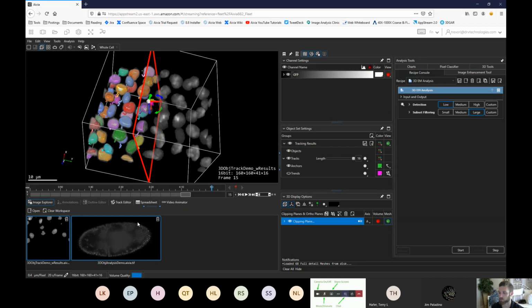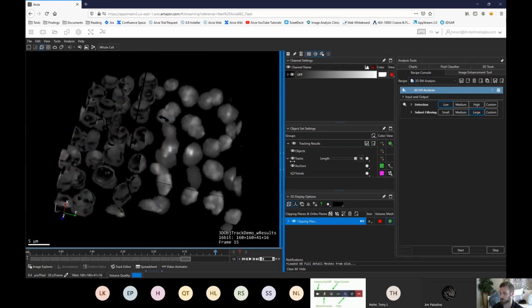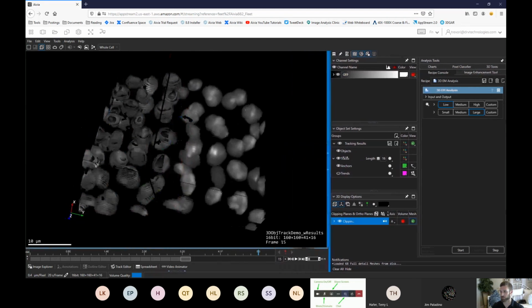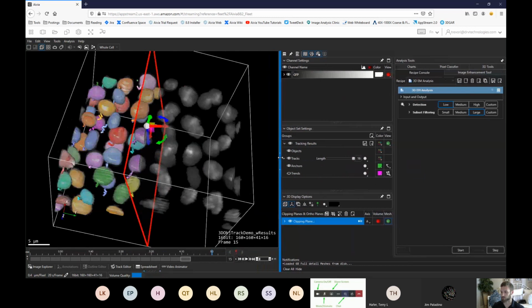A very simple way to do that is to click this blue bar. If you hover your mouse over it, it highlights blue. You can just single click that and it collapses. So now what I want to see actually occupies my entire viewer. The same can be said for this panel over here. In this case, our data has a square aspect ratio, so I don't really need to collapse or move this. I can leave it open. It's not that big of a deal.